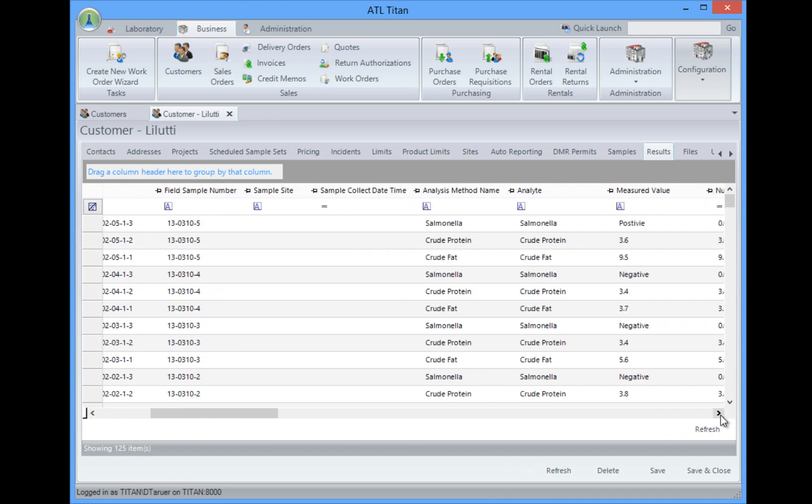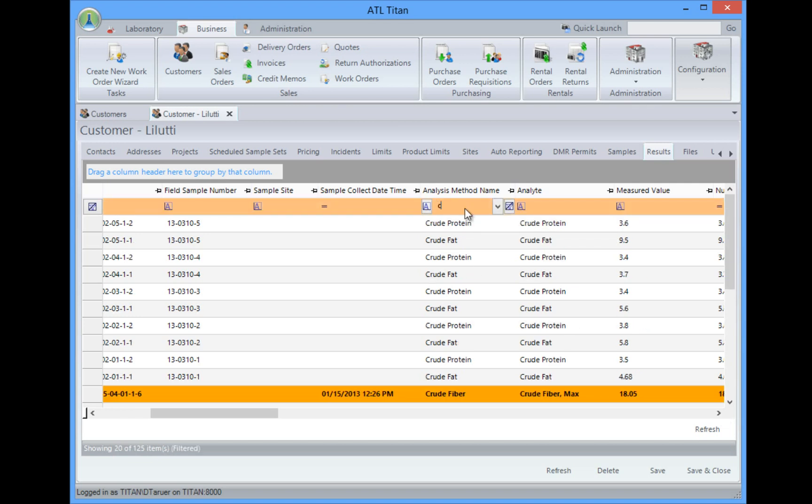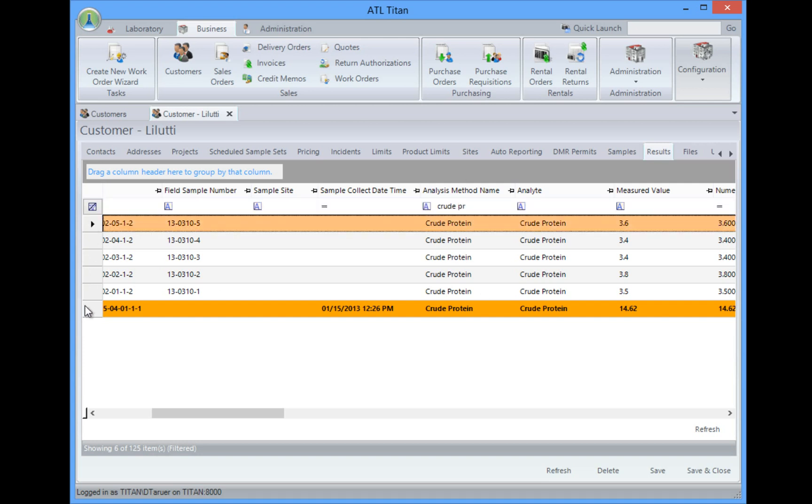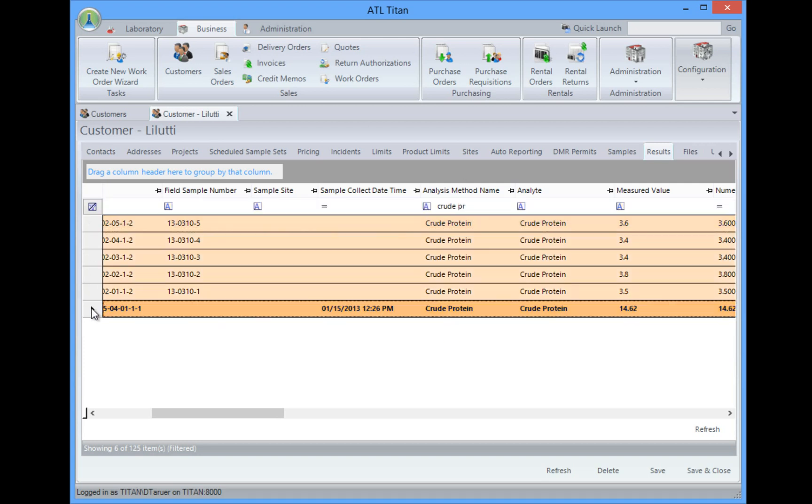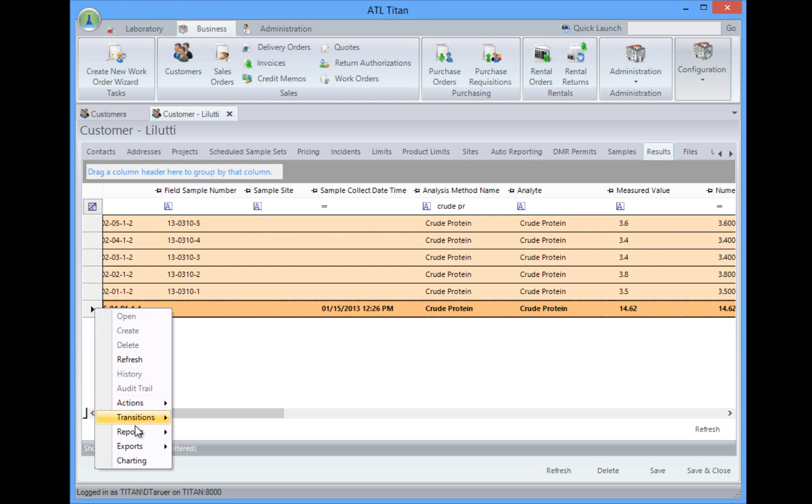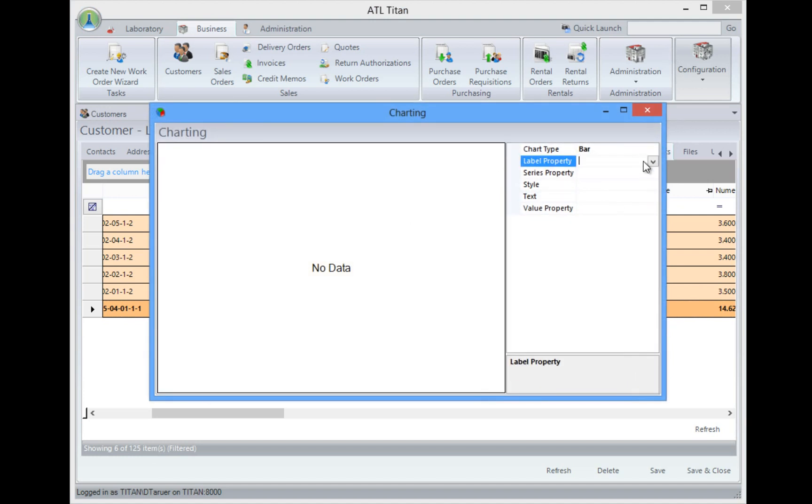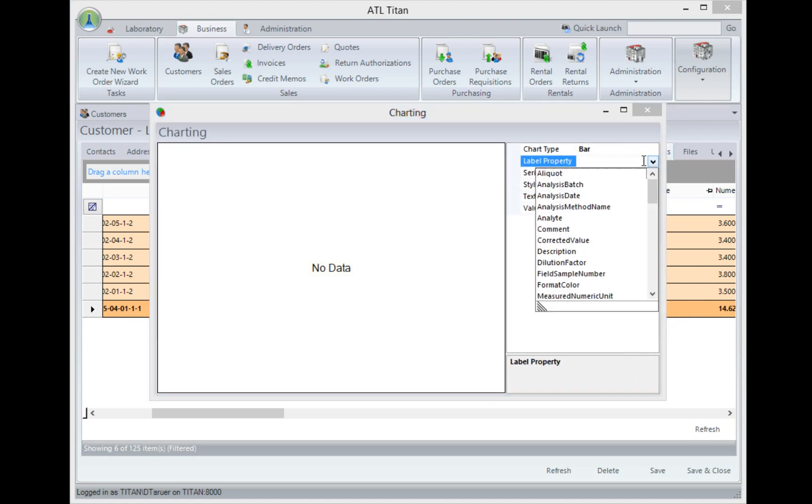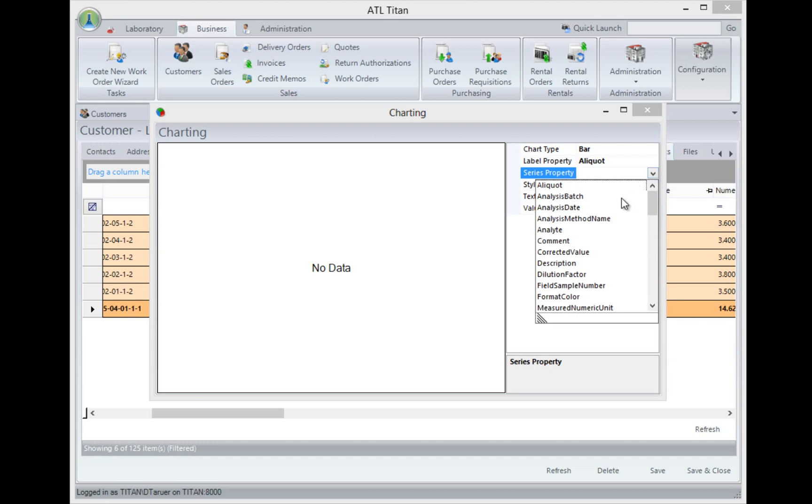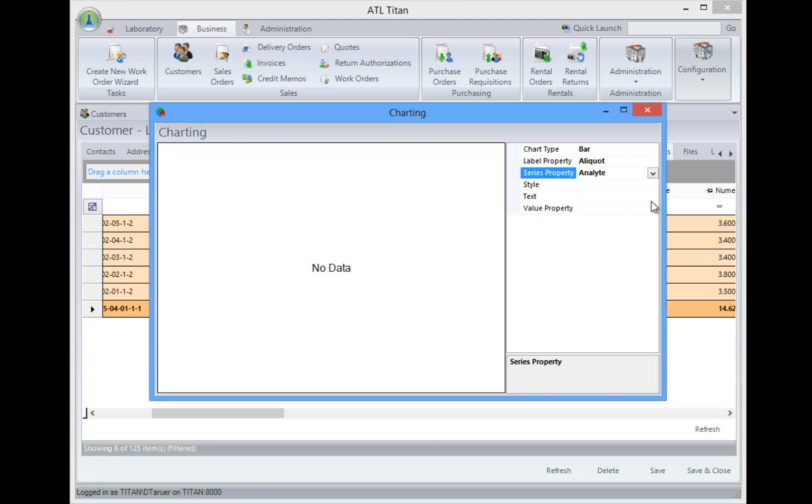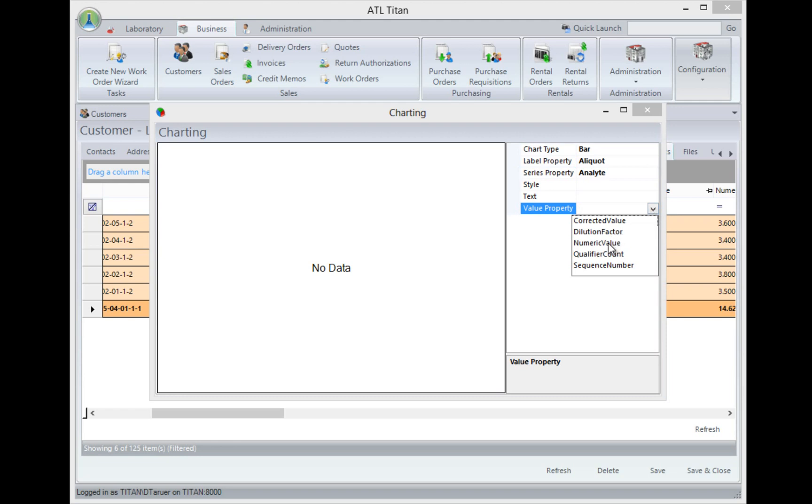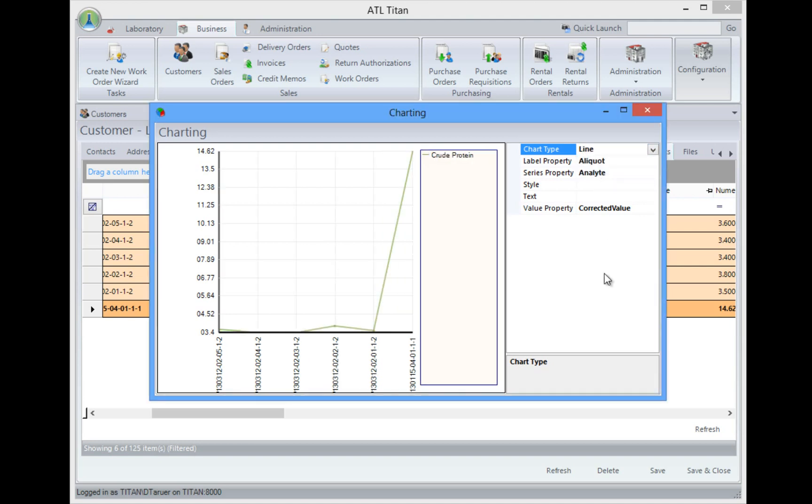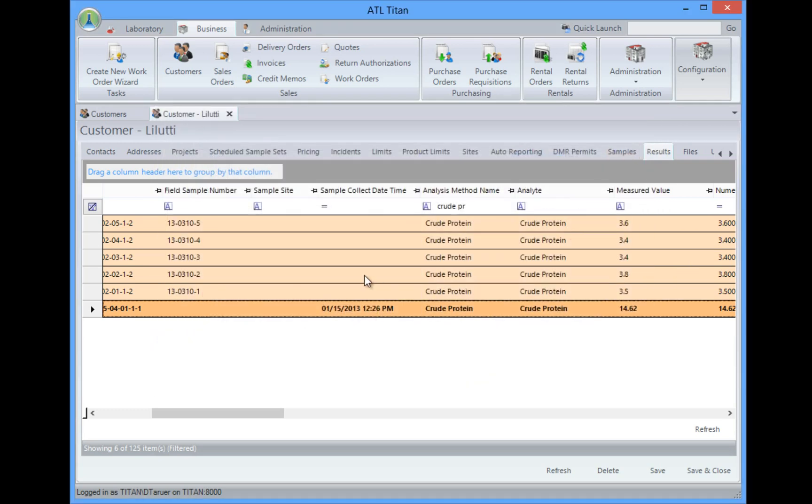Scroll over and there's our results all here. So if I wanted to do something like do a trend chart for some results, I could come in and take a look for all the crude protein, highlight my data that I want to chart, right click, go to charting, and from here I can very easily select the information I want to show on my chart and I can do a bar chart or maybe I might want to do a line chart. So it would be very easy to do trend analysis on your samples right from here.